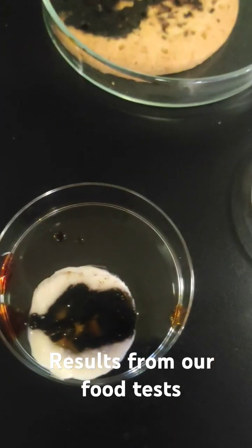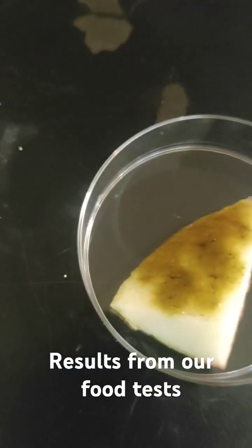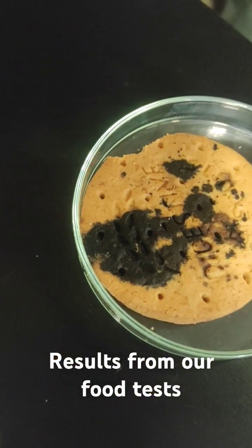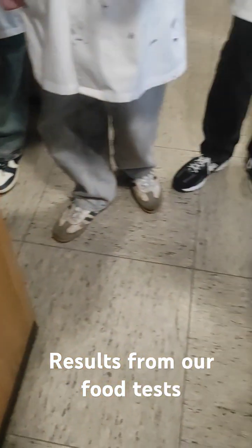So we see here banana have some starch, the apple have a little starch, and the biscuit has a lot of starch.